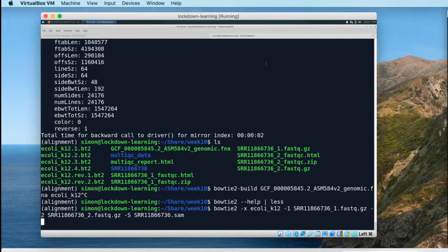If you think about what Bowtie2 is doing here, it's taking a pair of reads and looking for an alignment of that pair of reads to the reference genome. And that alignment problem for that one pair of reads is independent of the alignment problem of all of the other pairs of reads. So you can run that alignment process for multiple reads simultaneously because they're all independent of one another. That's what the parallelization does for Bowtie. It takes those 1.4 million separate alignment problems and splits them up among the available threads.